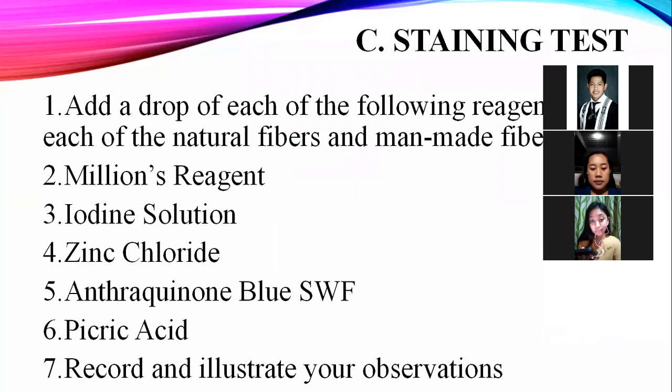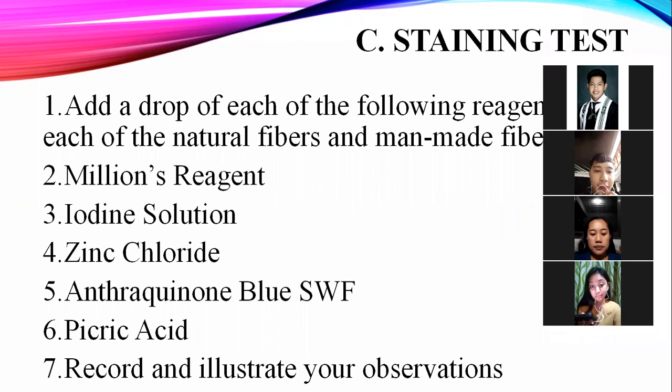Next is the staining test. Add a drop of each of the following reagents to each of the natural fibers and man-made fibers. Next, Millon reagent. Third, iodine solution. Fourth, zinc chloride. Fifth, anthraquinone blue SWF. Sixth, picric acid. And lastly, record and illustrate your observations.